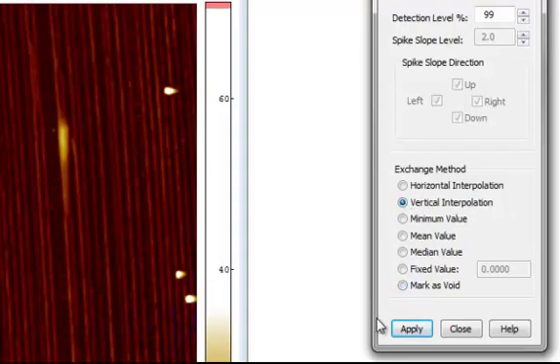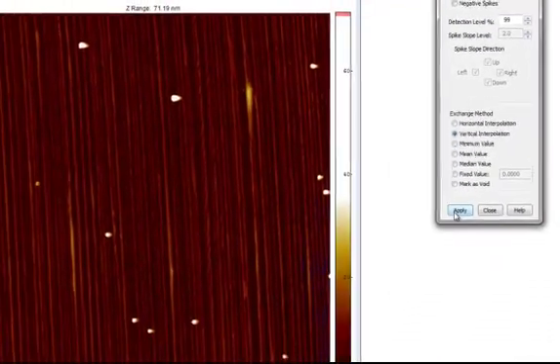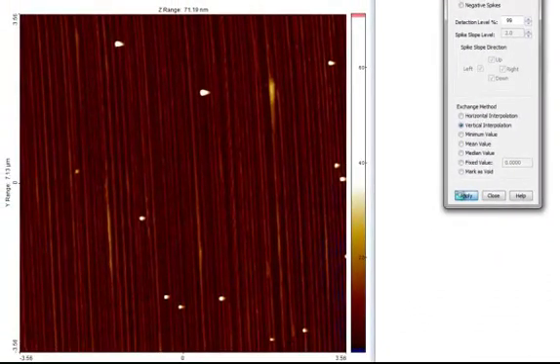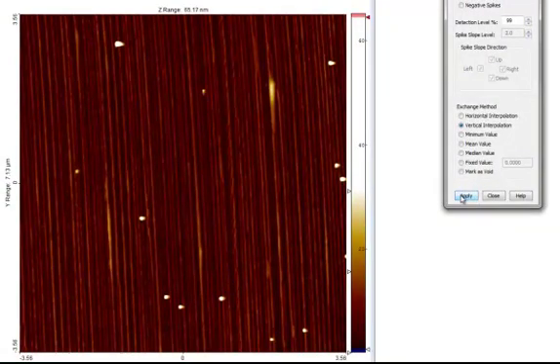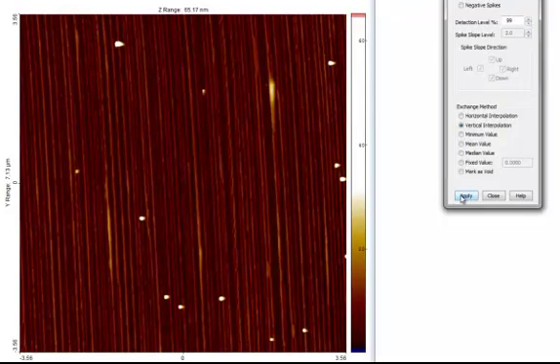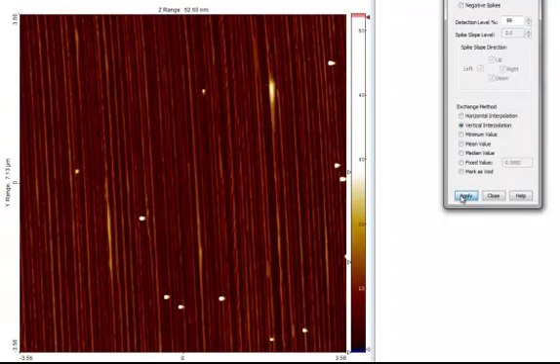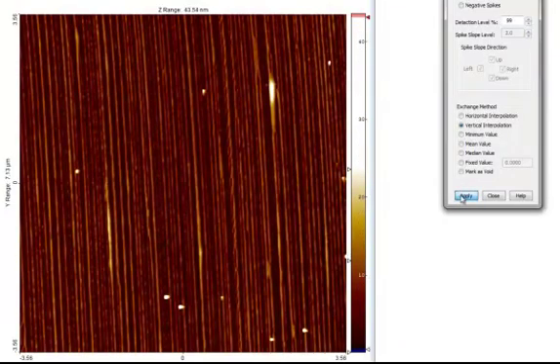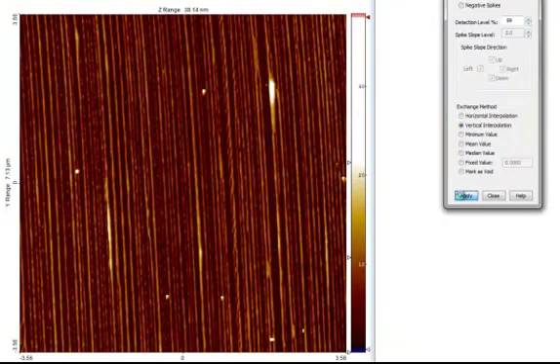Now we can go ahead and press Apply. Since we kept the threshold high, only a few particles were removed. We can simply press Apply multiple times, until all the unwanted particles have been removed.